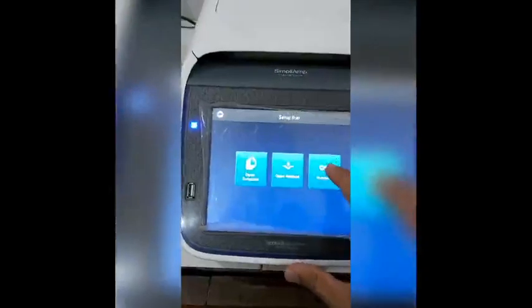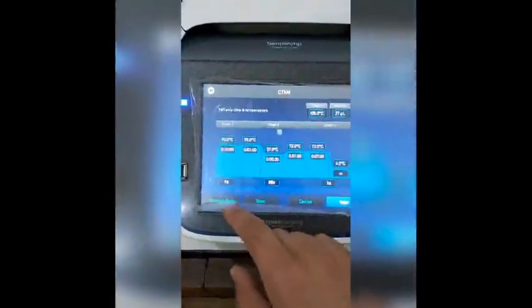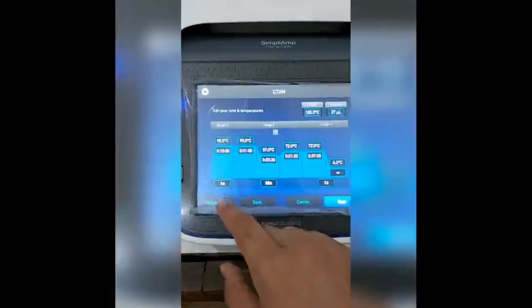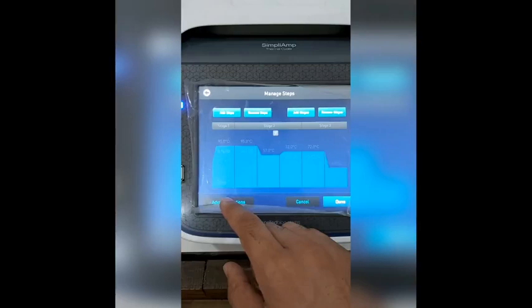Go to the setup, open method, and you can see the program — for example the CTXM gene. You can run the PCR in two modes: gradient mode and normal PCR mode. The gradient PCR is run in cases where you do not know the annealing temperature of the primers you are using for the PCR reaction. First, I will show you how to set up the PCR machine for the gradient mode.